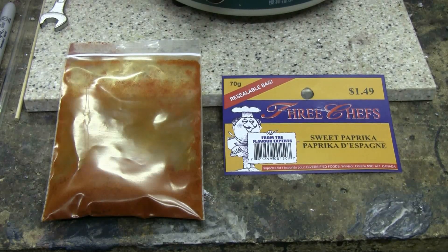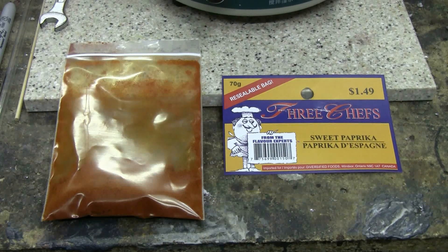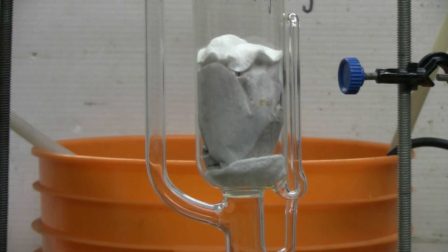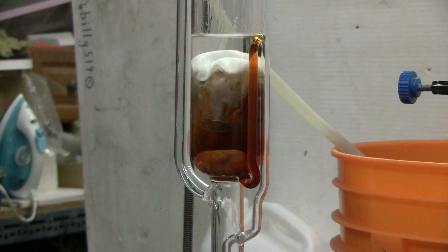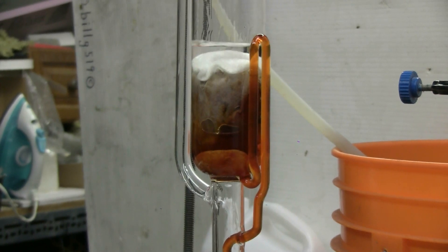I got some powdered sweet paprika at the grocery store so I decided to try a Soxhlet extraction of sweet paprika using ethanol as my solvent. About 35 grams of the powdered sweet paprika have been rolled up in a coffee filter and placed in the Soxhlet extraction chamber. This will be the first cycle of extraction. The extract is a nice brownish orange color and there it goes.